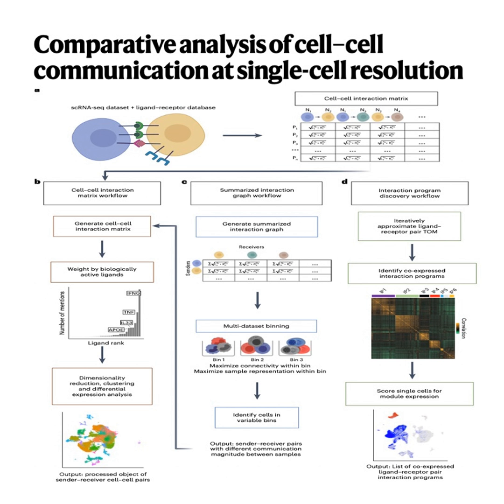First, it uses something called cell ID to figure out a unique gene signature for each individual cell. What makes that cell tick right now? So a molecular fingerprint for every cell. Sort of, yeah. Then it brings in another tool called NicheNet. NicheNet has this curated database and model that predicts which ligands are most likely responsible for driving the observed gene signature in a target cell.